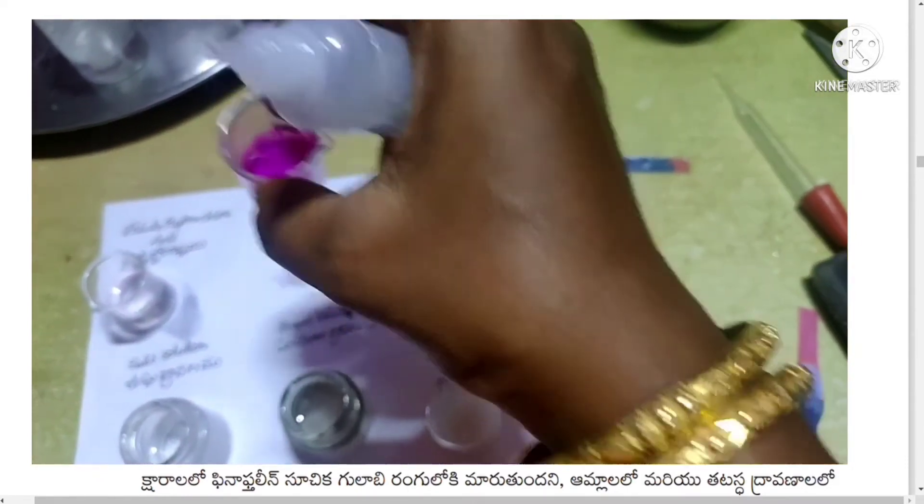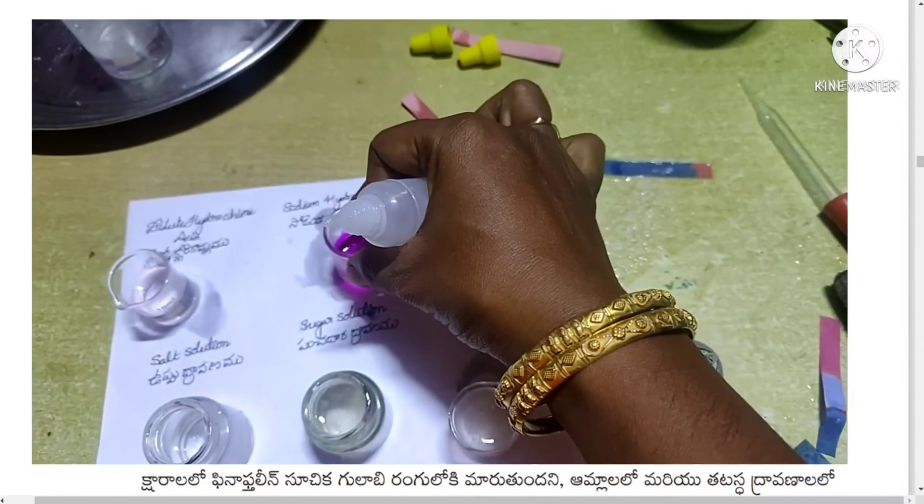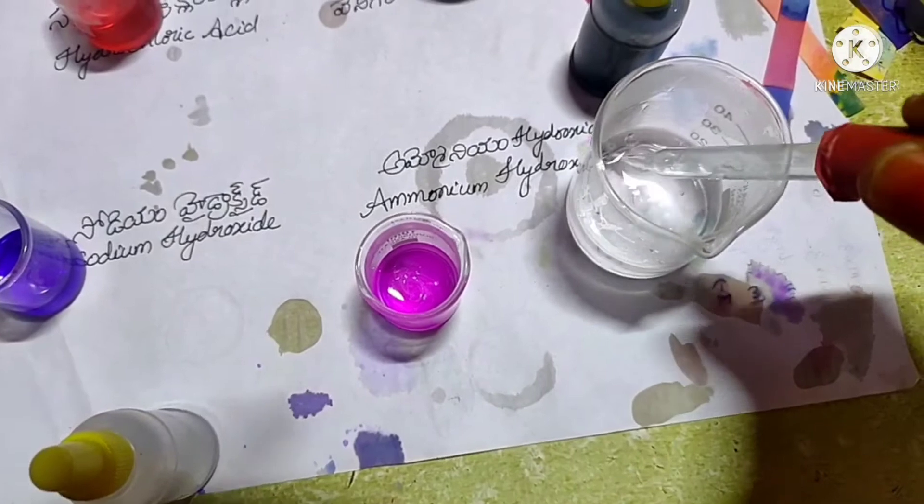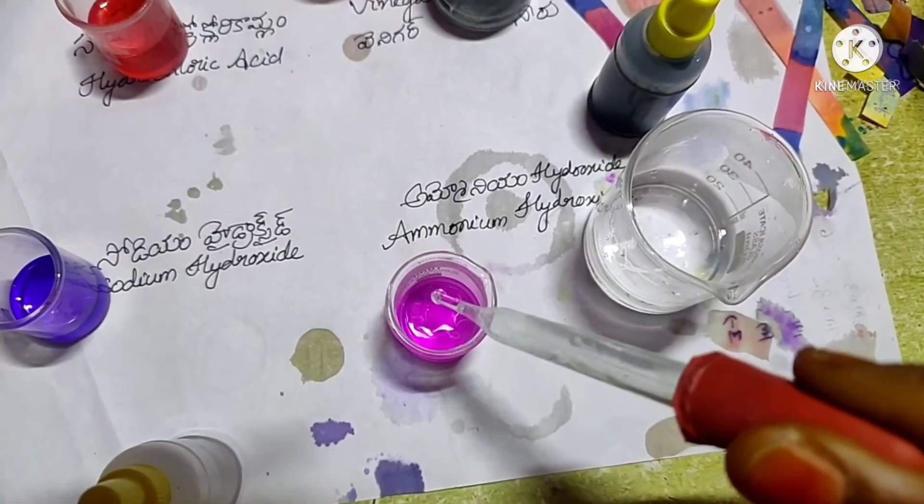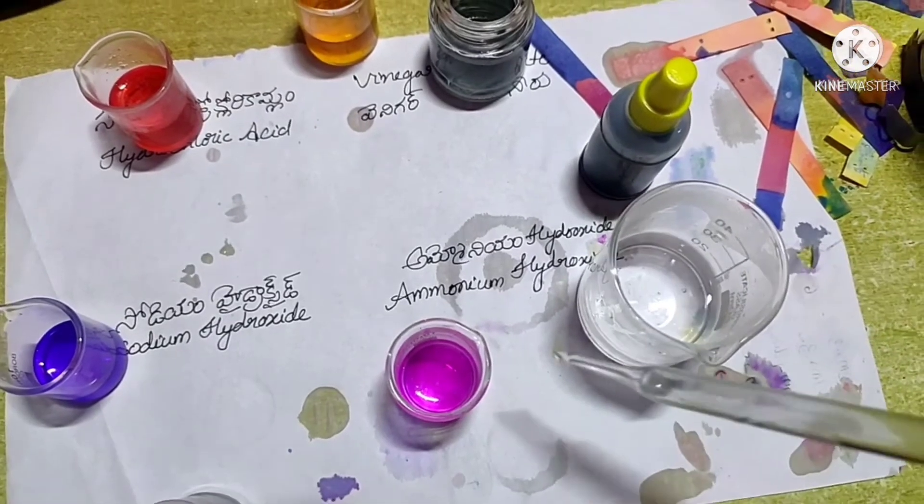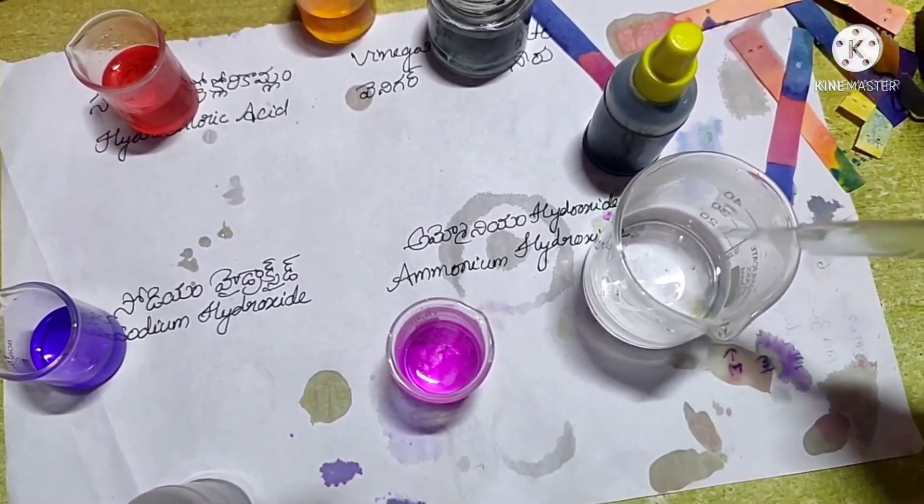Using a dropper, add dilute hydrochloric acid drop by drop to this solution and stir gently. Continue adding acid till the pink color disappears. Now the solution is no more basic, as it was neutralized by the acid.